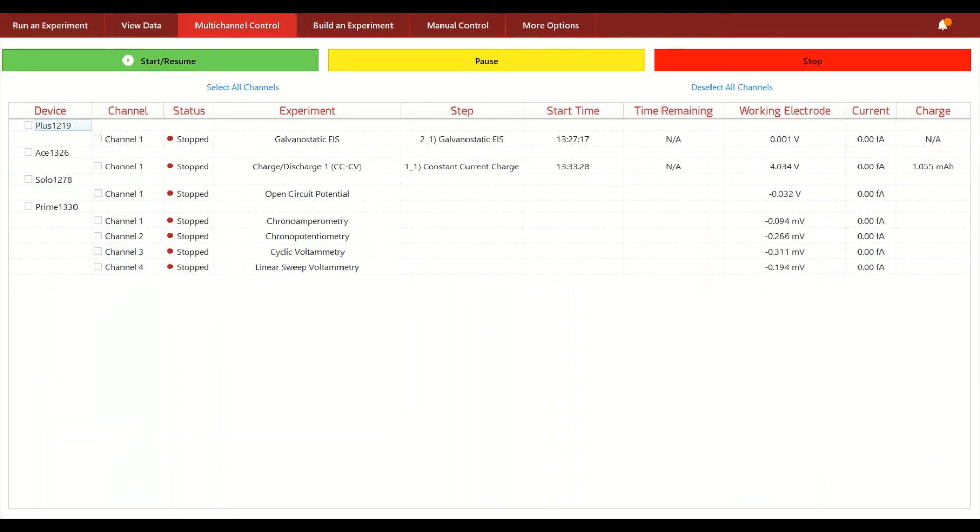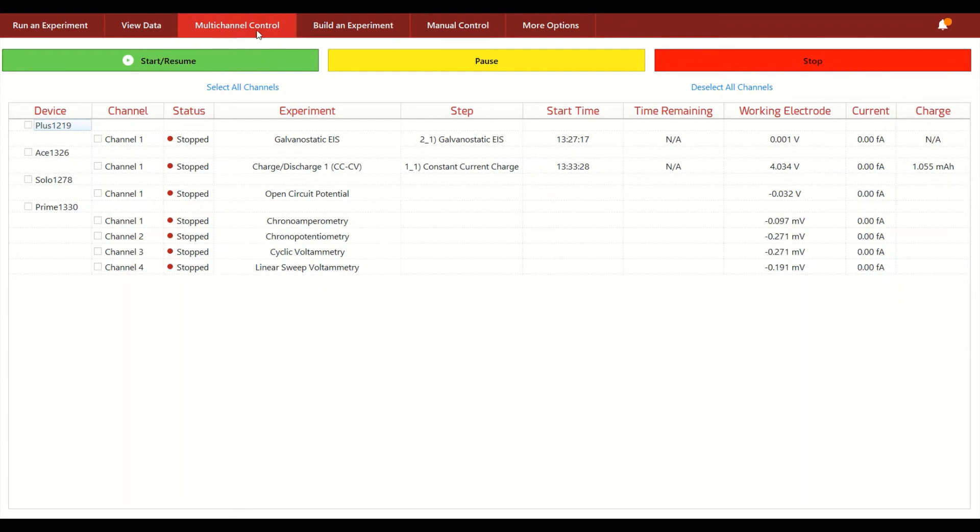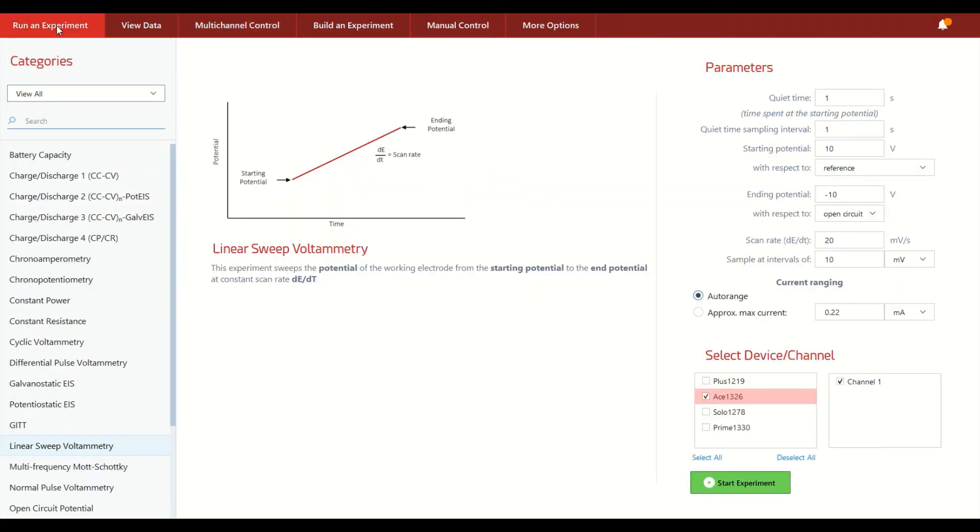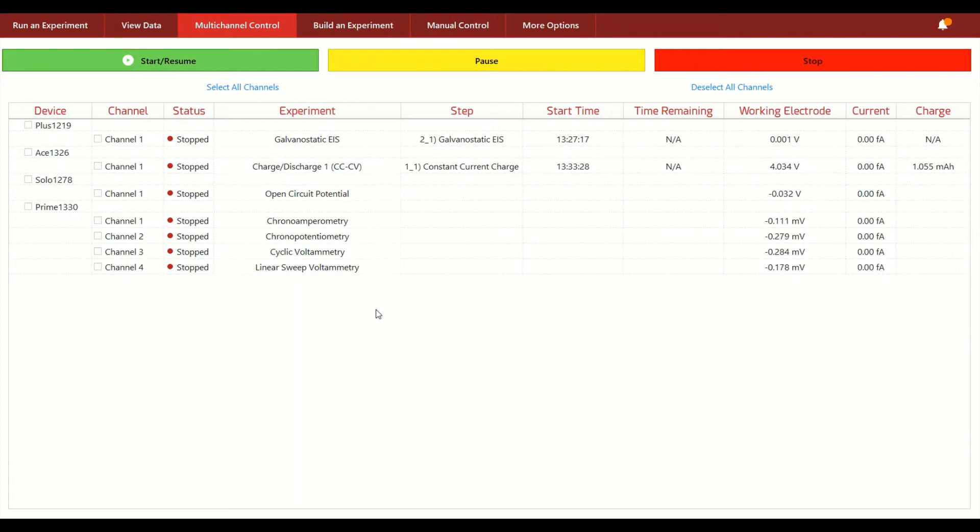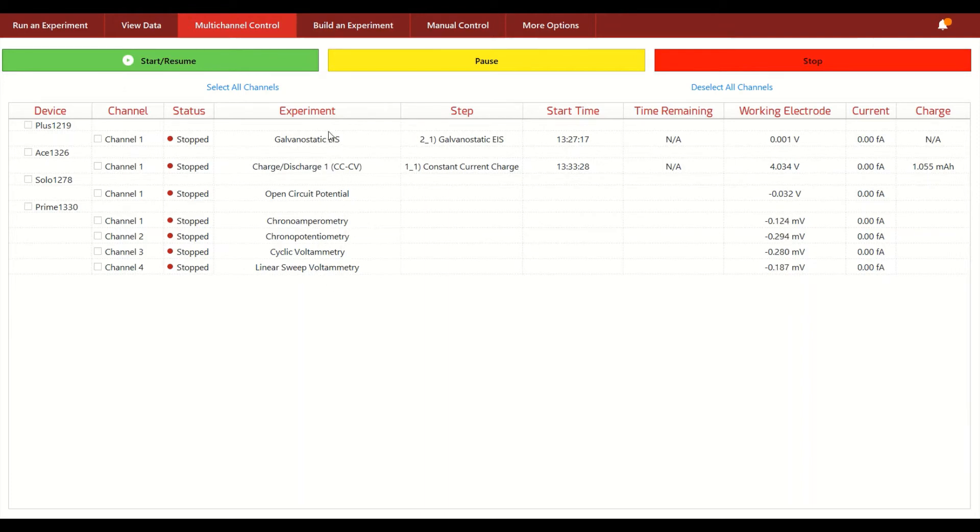For those of you that do typically run many different channels at the same time on a single computer, we have our multi-channel control tab which has many of the same capabilities of the run an experiment screen but with more flexibility and options that are optimized for running either the same or different experiments on many channels at once. So we see here again the four different Squidstat units that are plugged into my computer right now with all the available channels on each one of those that can then run all the different experiments that are currently loaded onto each one of these.